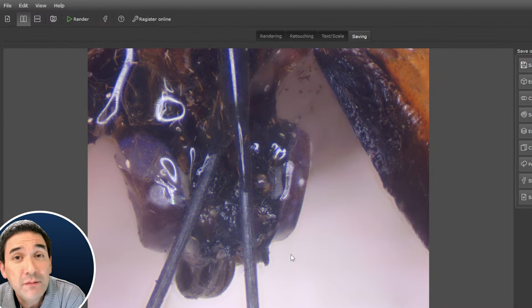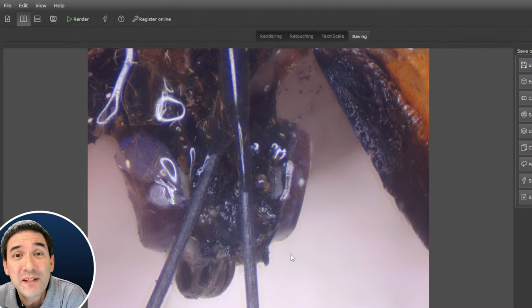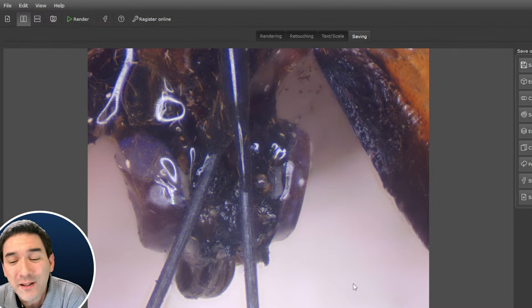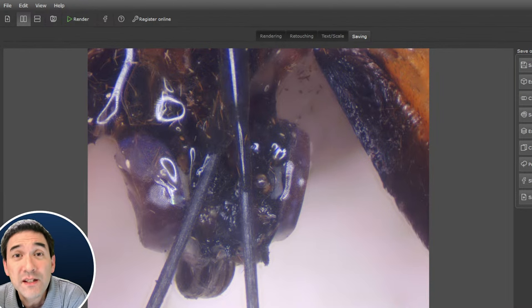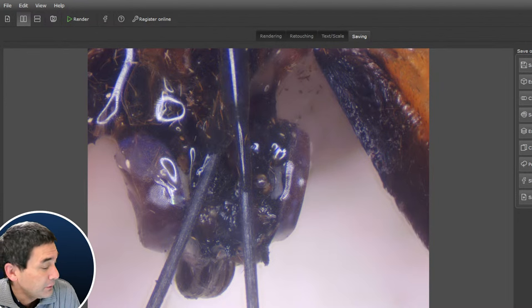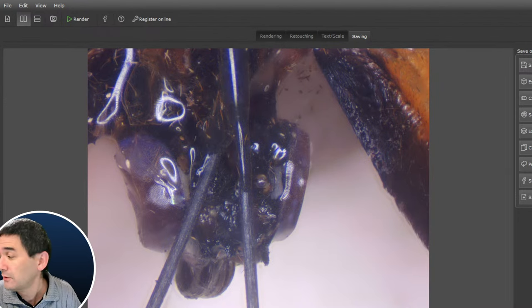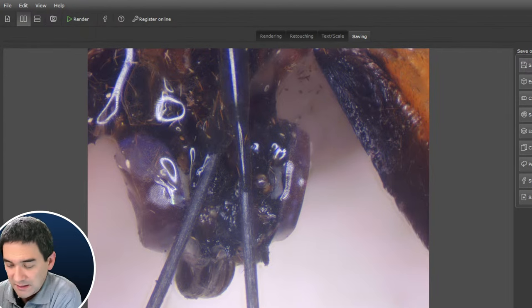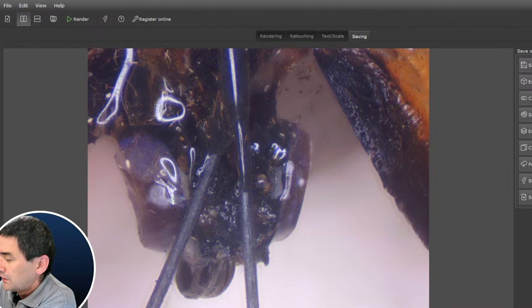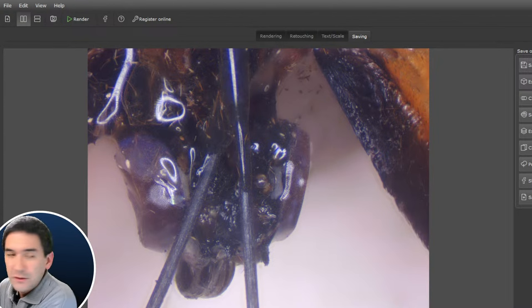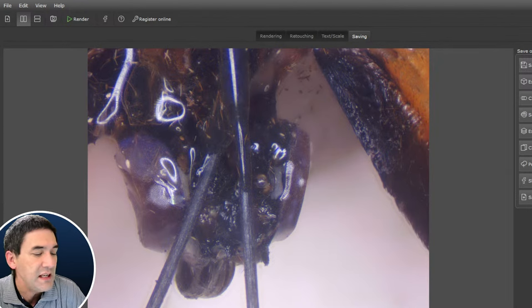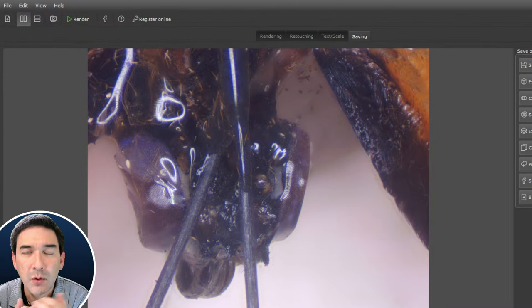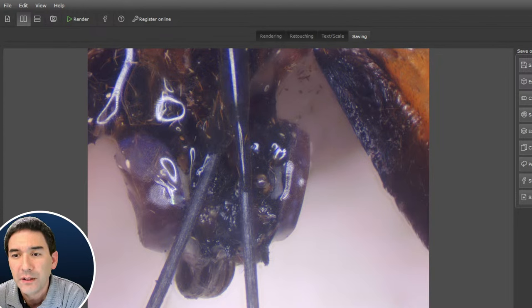This is basically a very simple way of doing focus stacking. Now the question is — what happens if you do not have a stereo microscope? Can you do something similar with a compound microscope? The answer is yes. If you use the four-times low power objective, you can also get images. You can try putting specimens directly on the stage with light coming from the top and do focus stacking that way.